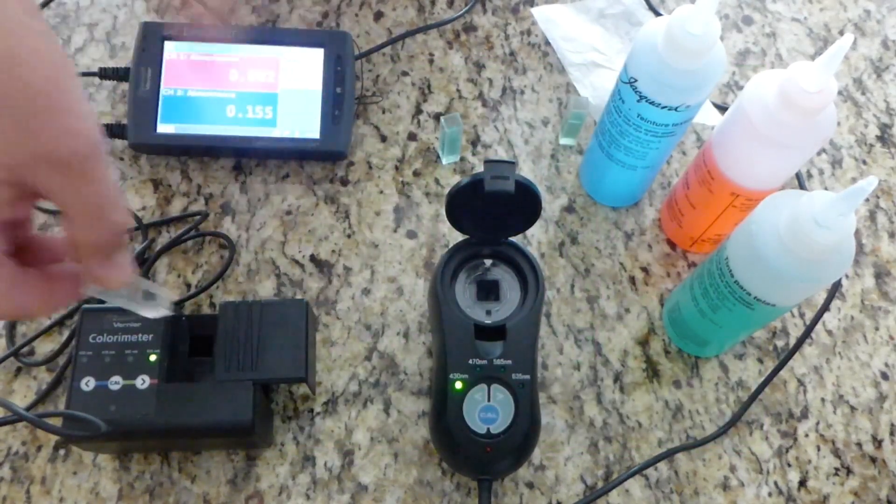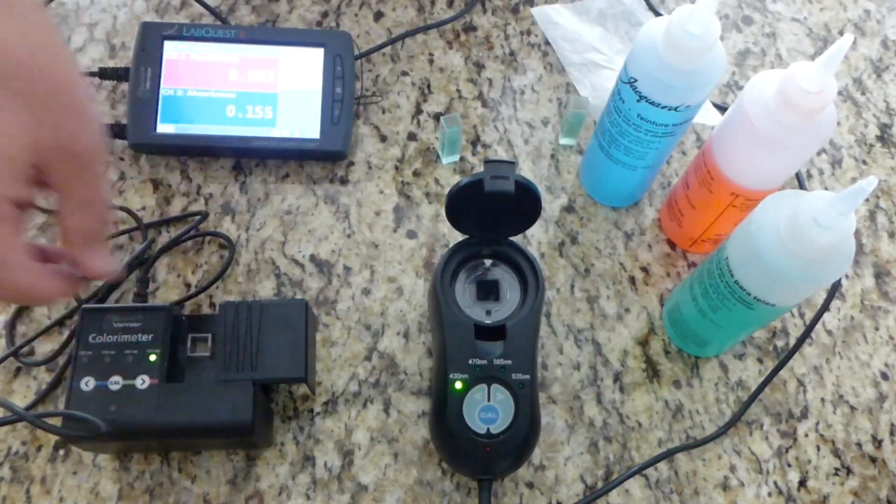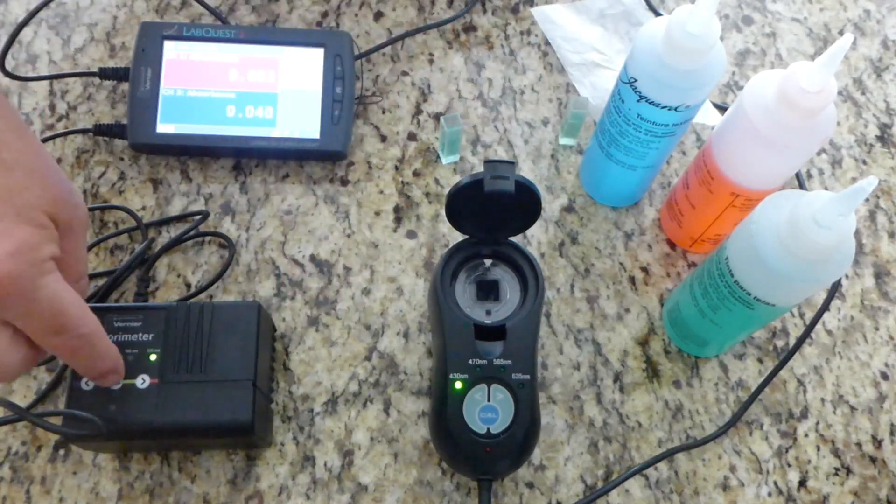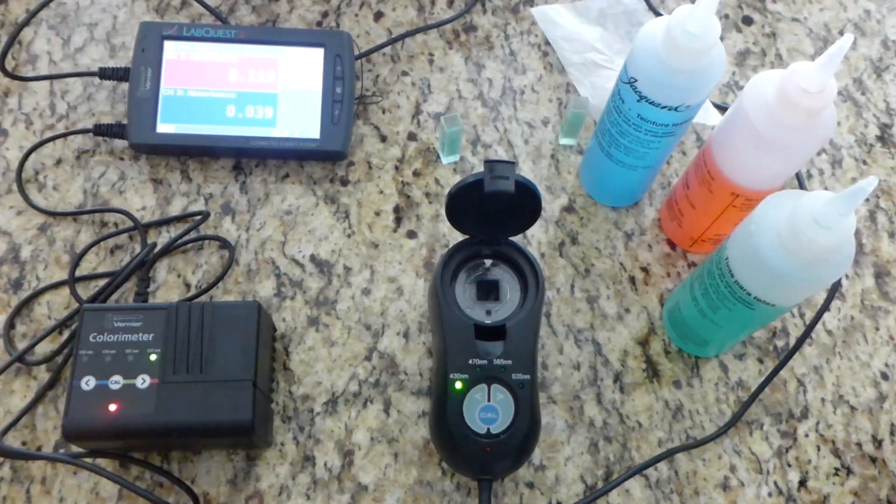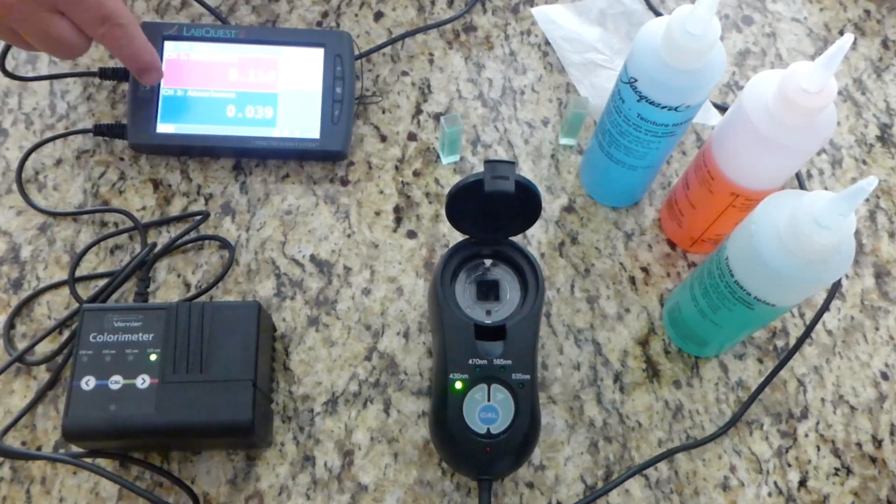The other device works very similarly. You put it in the direction that the light will go, be sure to close the door, push the calibration button, and it will reset itself to zero as well.